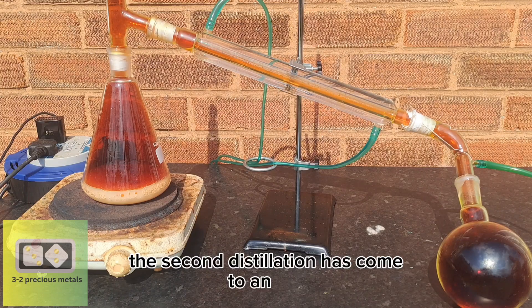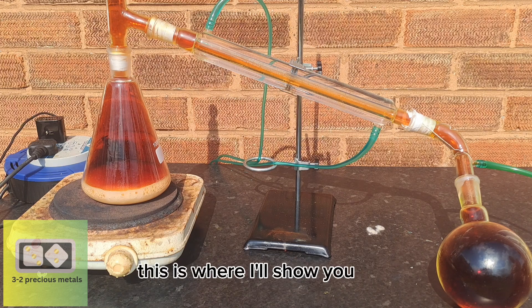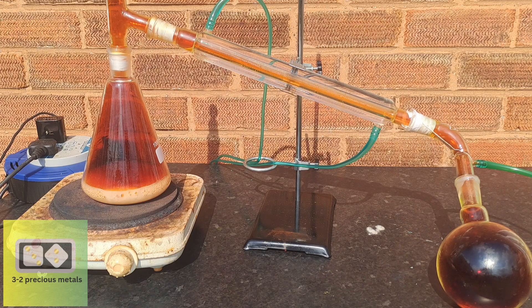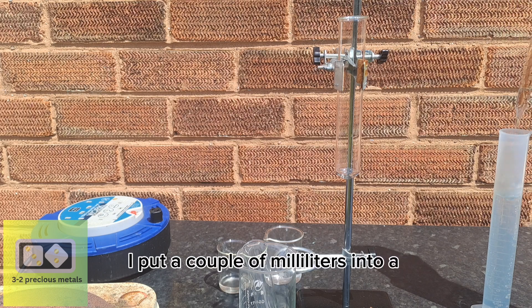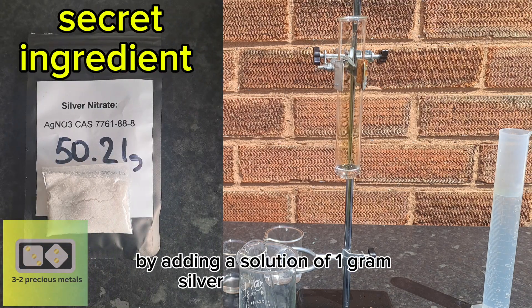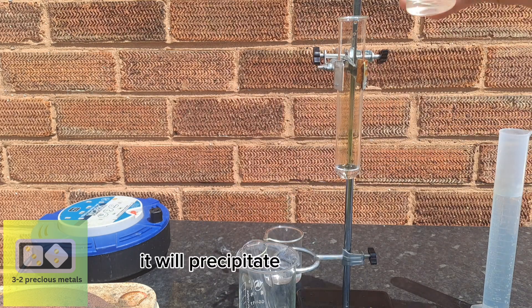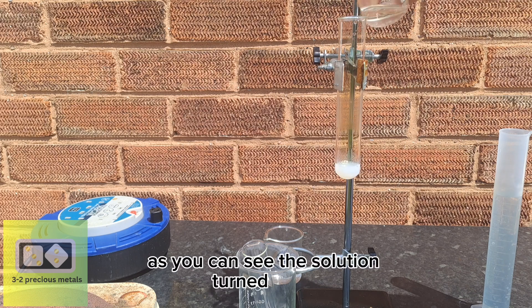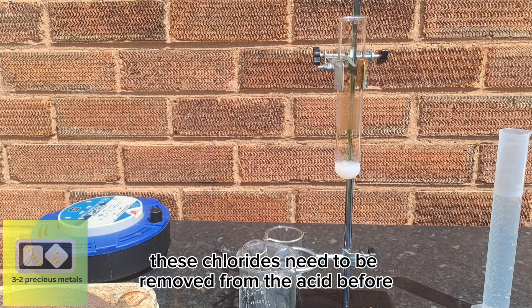The second distillation has come to an end, so now it's time to collect the acid and do a few tests. This is where I'll show you why most people fail when using homemade nitric acid. First, I tested the dilute acid in the graduated cylinder — I put a couple of milliliters into a test tube. I'm going to test the solution for chlorides by adding a solution of 1g silver nitrate powder in 10ml of water. If there is any chloride contamination it will precipitate out silver chloride. As you can see, the solution turned white, which means there is some contamination.